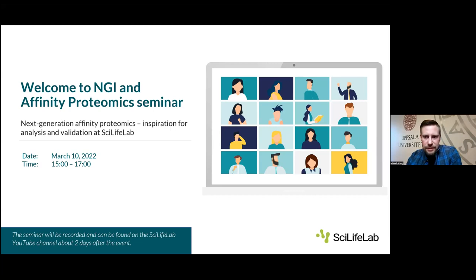Okay, so my name is Mikael Åberg, and I'm head of the Uppsala part of the Affinity Proteomics unit. This is a co-hosted seminar together with the SNPseq platform in NGI Uppsala. And it will be mainly about Olink Explore, this multiplex protein detection method that's been on the market for a little over a year now.